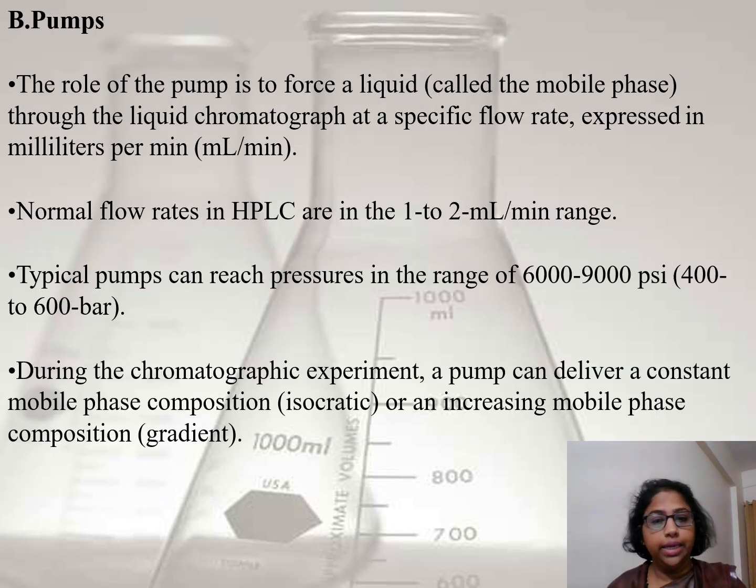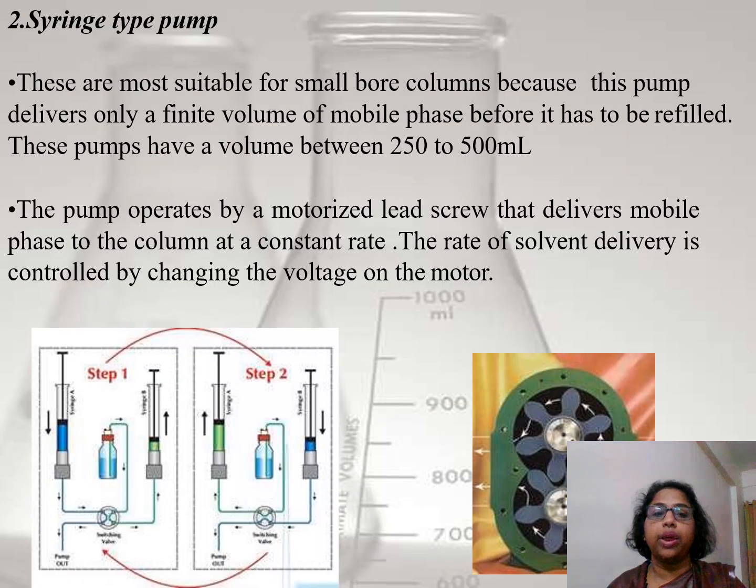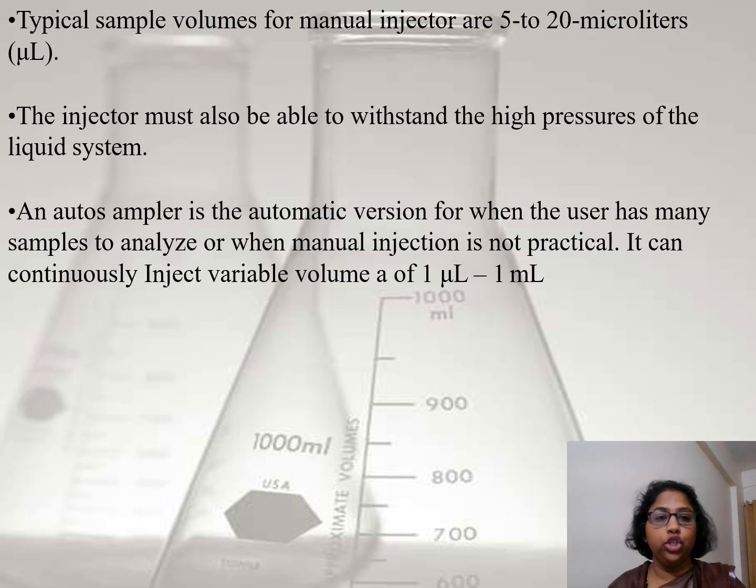So we will learn in detail the types of HPLC, the types of pumps which are used, and the types of detectors and injectors which are used in the further class. Thank you.